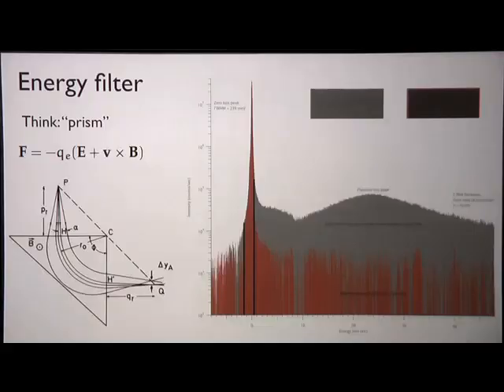Shores told you yesterday that the inelastic electrons basically cause damage but don't give us imaging capability. And so for thick specimens, like the kind you would use for tomography, this can be particularly useful, because if you just clip off right around the primary beam here and get rid of all of these inelastically scattered electrons, you do increase the contrast in your image. This is just a carbon film, and this is with and without the energy filter turned on. Okay, filtration.